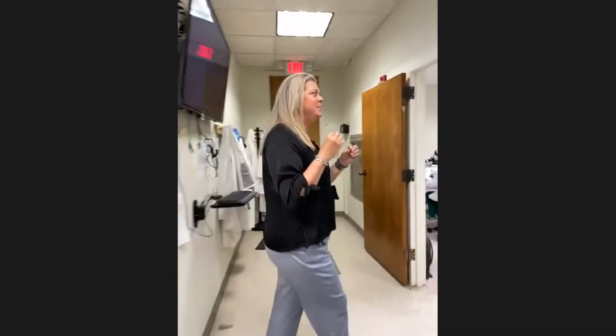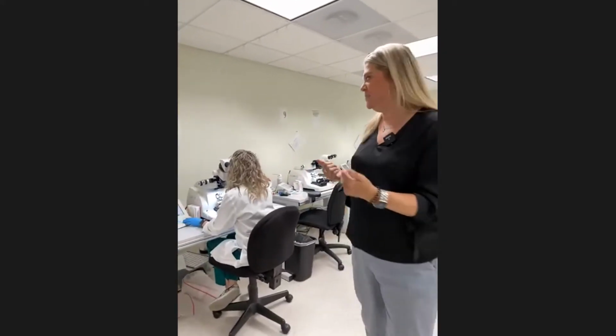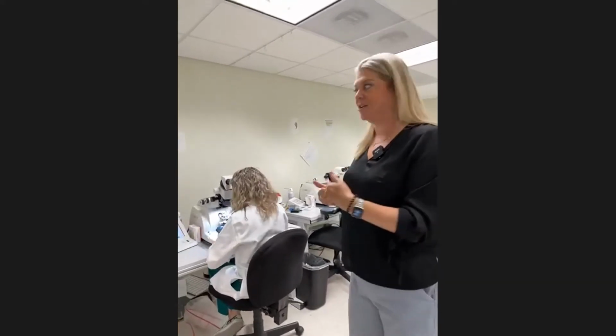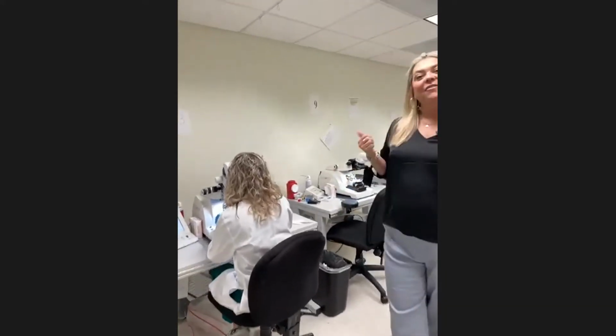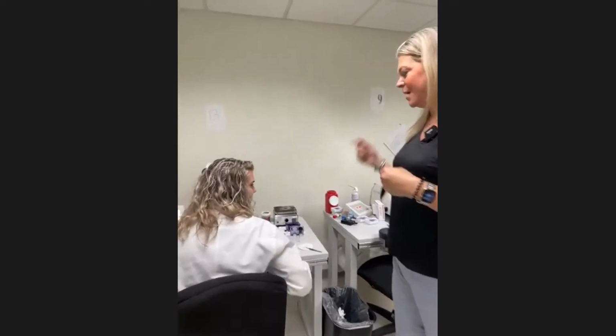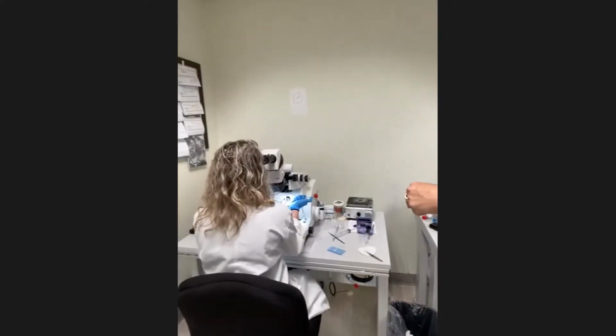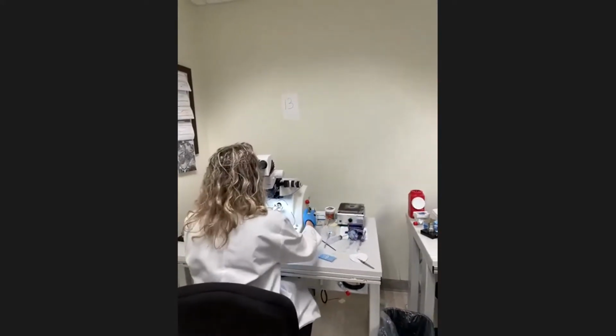And we're dealing with pieces of tissue that are so tiny. Like imagine taking a grain of sand and slicing it into pieces. That's kind of what we're dealing with back here in electron microscopy. Very cool, very detailed. Takes a lot of time and training to get up to speed to know how to cut an electron microscopy block. So I've got my friend Brianna here, and she is working on a section right now. So the first thing that I will tell you is, again, how small it is.